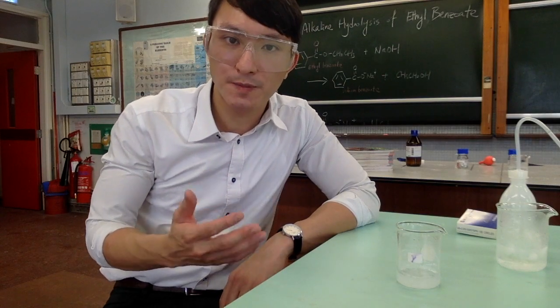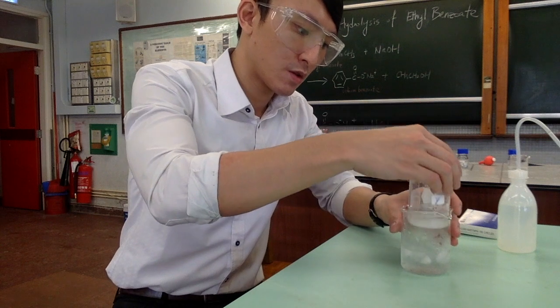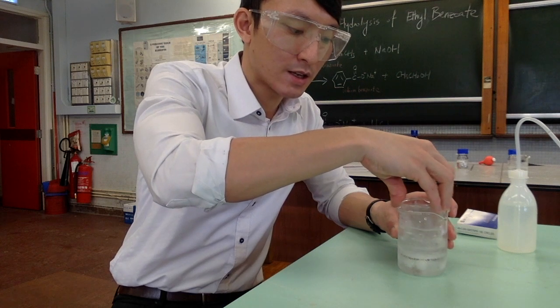Now, after 5 minutes, we will further cool it down using an ice water bath. This is to make sure all the benzoic acid will be crystallized.